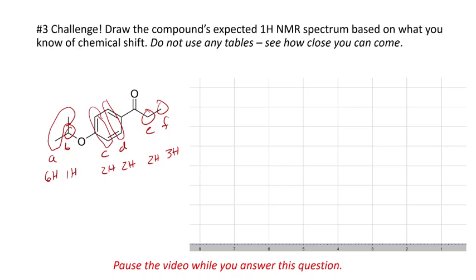Chemical shift-wise, we expect the A to be somewhere around 1, F also to be somewhere around 1, B somewhere between 3 and 4, well, maybe call it 3.5. The shielded oxygen one around 6.8. Protons adjacent to the carbonyl group around 8.1 maybe. And the protons in E adjacent to the carbonyl group at, we'll say 2.2.